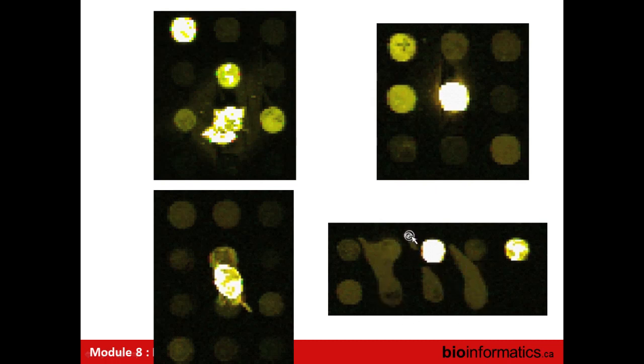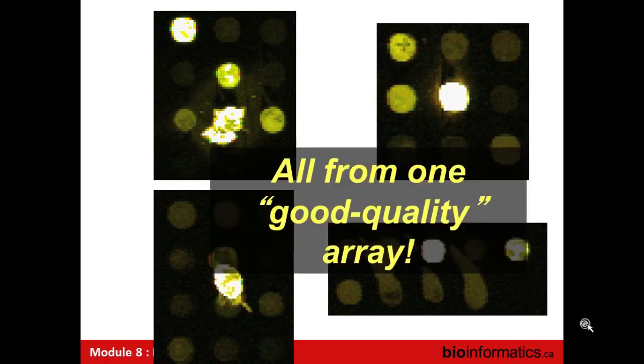And look at this weird thing where there's a little pseudo spot off to one side. Segmentation is going to have disasters with that. And of course, all of those are from a single quality array that we analyzed and published on several years ago. So there's nothing that stops you from using data like this if you're able to potentially address it. But the problem is, we have to be able to address all those issues.